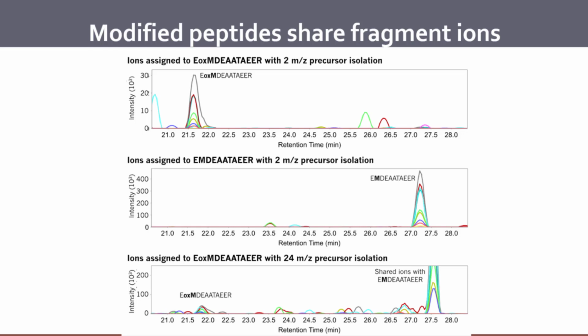So what we've basically done is say this oxidized peptide is present, but we've mapped it to the unoxidized signal. This is going to be a common problem if you don't have really nice and tight retention time information. Given that we have a chromatogram library that says the oxidized peptide shows up in this narrow retention time window here, we can exclude this using retention time. But without that information, it would be really hard. If you only had the ability to predict retention time within plus or minus 5 minutes or so, it would be quite a bit harder.